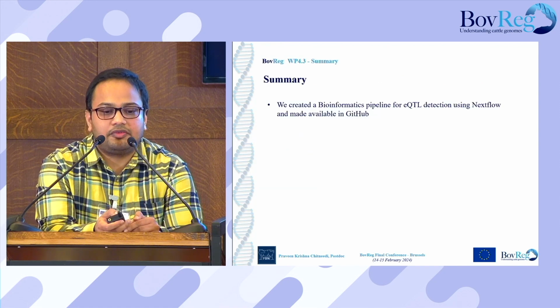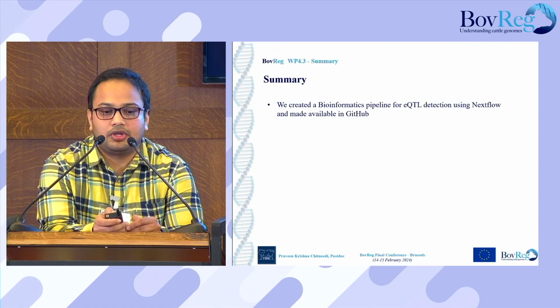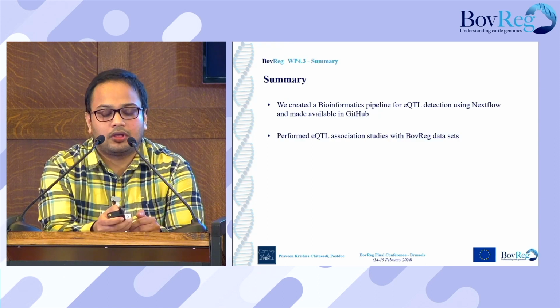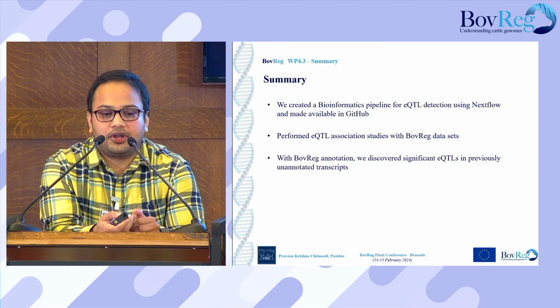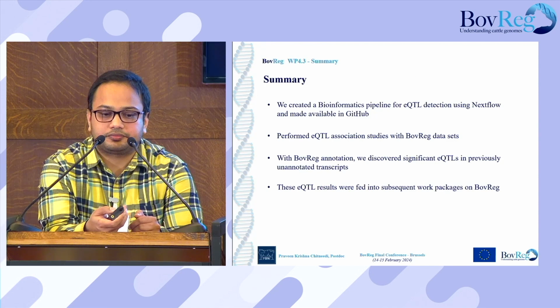So in summary, we created a bioinformatics workflow for eQTL detection using Nextflow, which is currently available on GitHub. We performed an eQTL association study with our BovReg datasets. And with the BovReg annotation, we discovered significant eQTLs for previously unannotated transcripts.